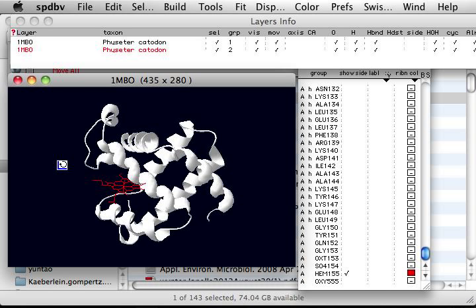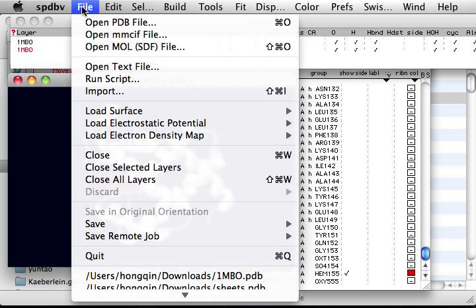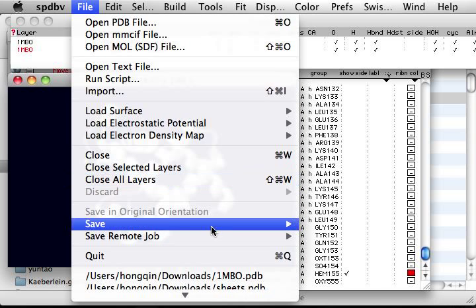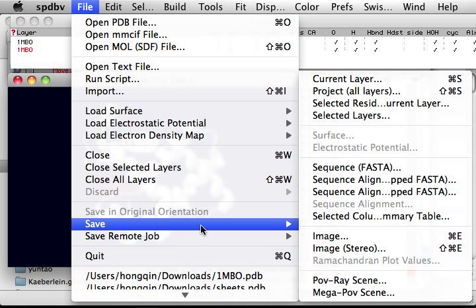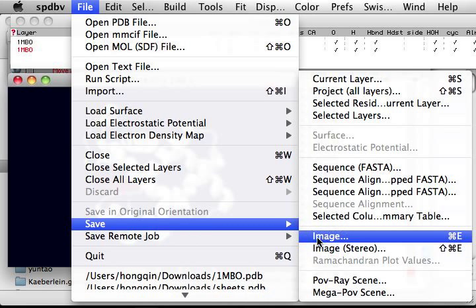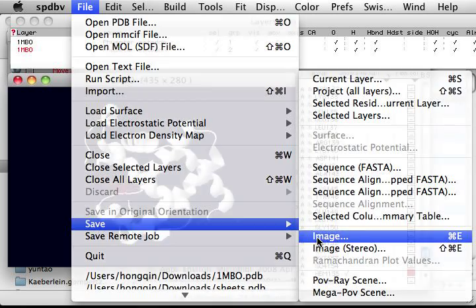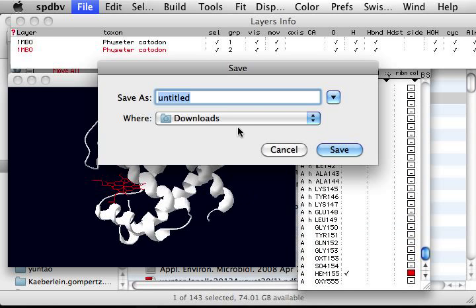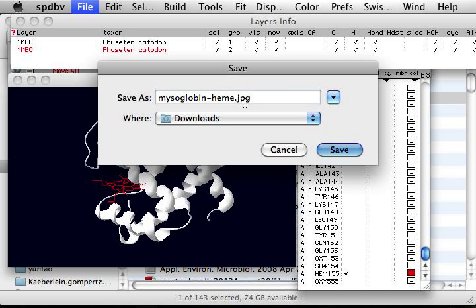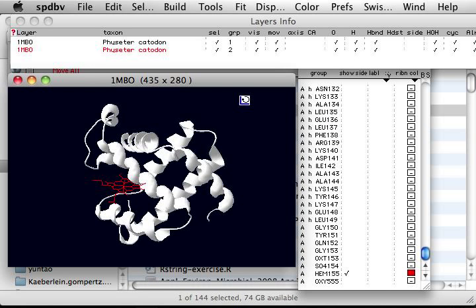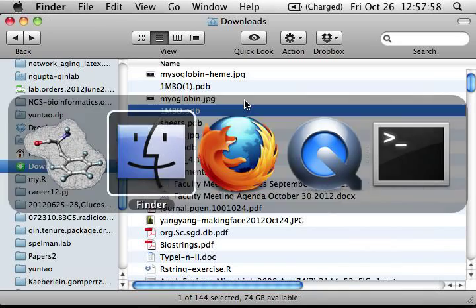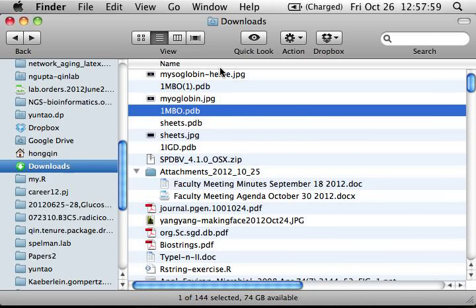I'm going to save it now. Save image. This is for the report. Let's say myoglobin heme.jpg.